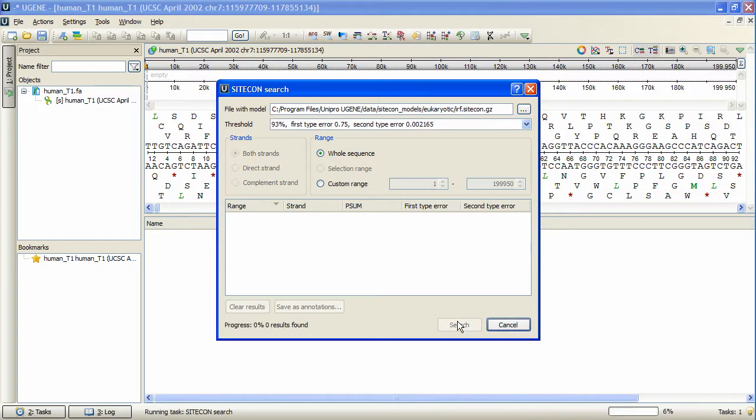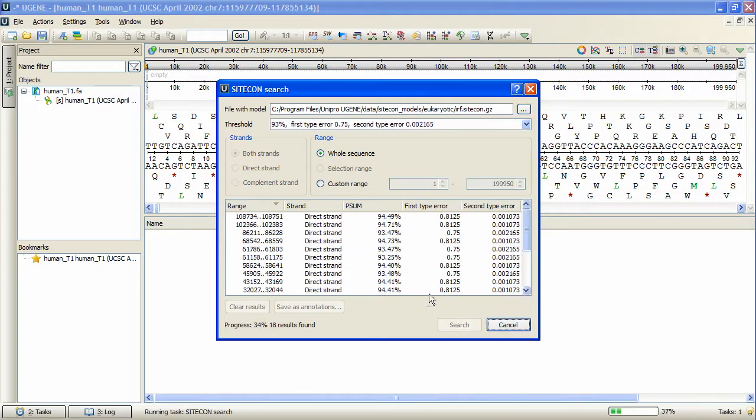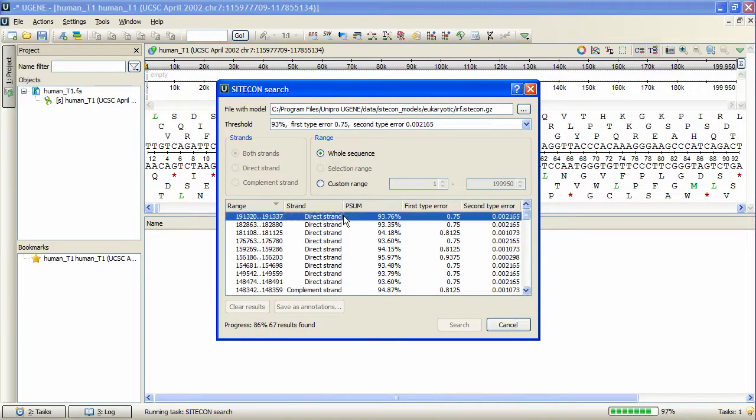The search results are placed into the dialog's table, as table rows, and contain p-sum and first and second type errors values.